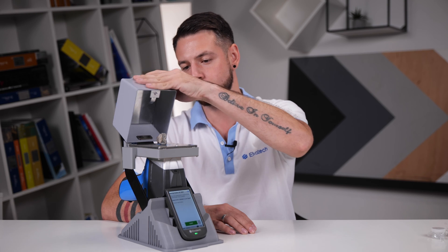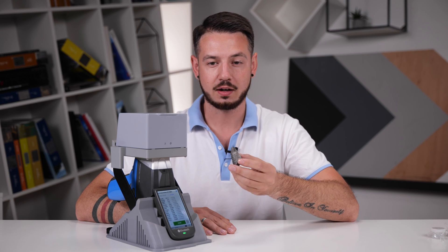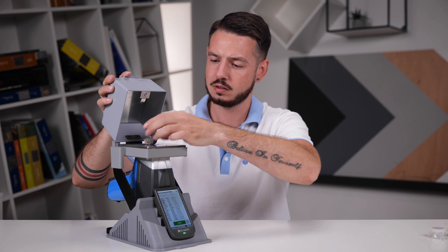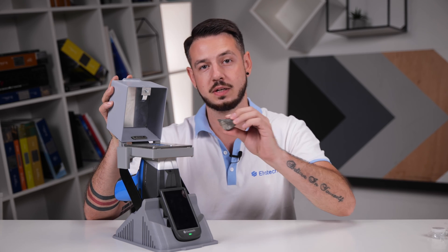Let's start. We just measured this side and as you can see, the analysis appears on the screen. Let's measure this side — just turn it and start the analysis. As you can see, the results are absolutely different in only one mineral. Now you know how to avoid sample preparation errors. Proper sample preparation is the first step to reliable analytical results with Prospector handheld XRF analyzers.